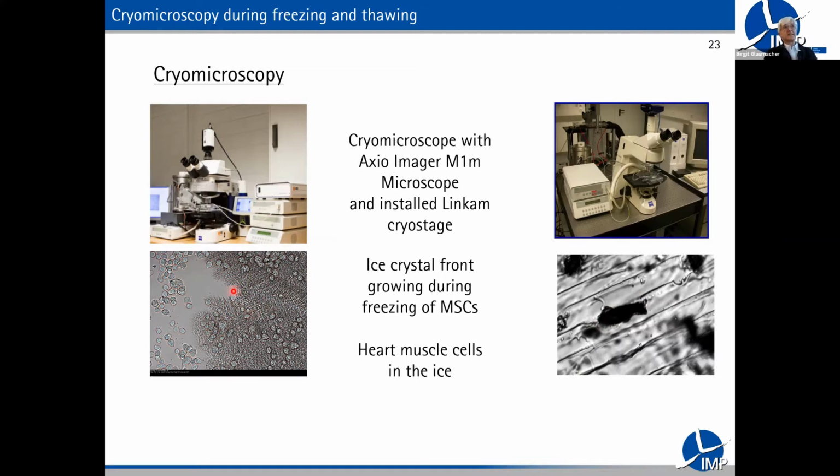It is interesting that in the cryomicroscopy, you could also do single cell tracking. This is something that we did in one of our studies, that you can really track the cells. And you remember the intracellular ice formation can be seen by darkening. And so we were able to track the darkened cells. And then we did the thawing, of course, and the viability testing. And what we found out is that not all the dark cells were dead.